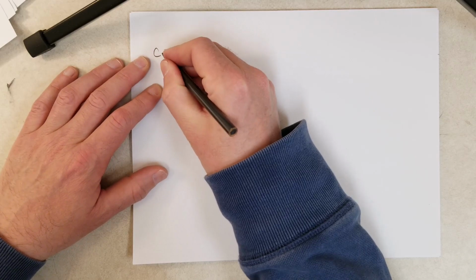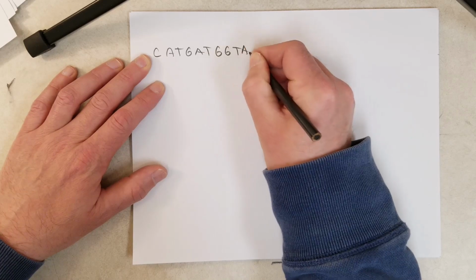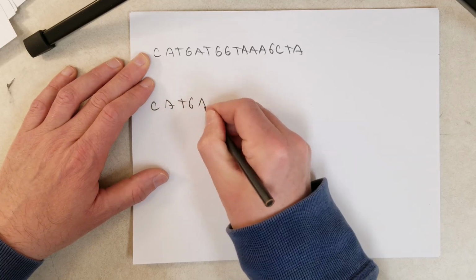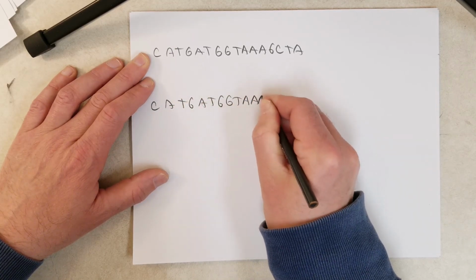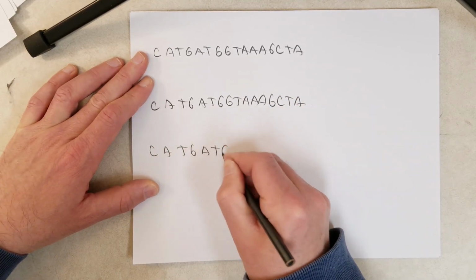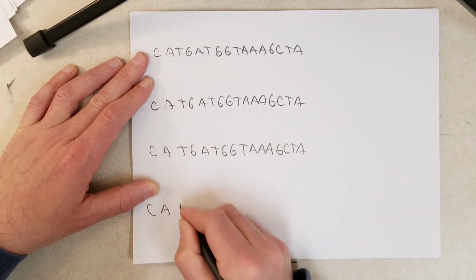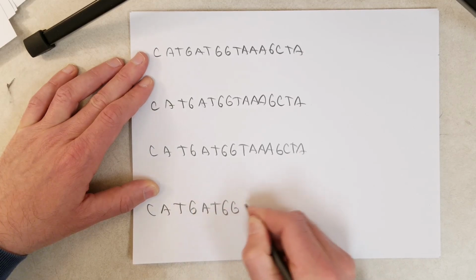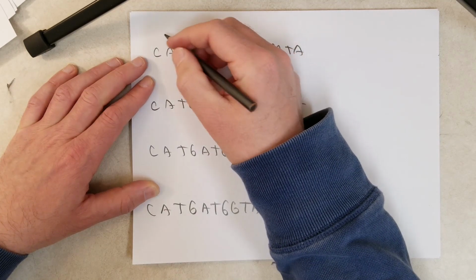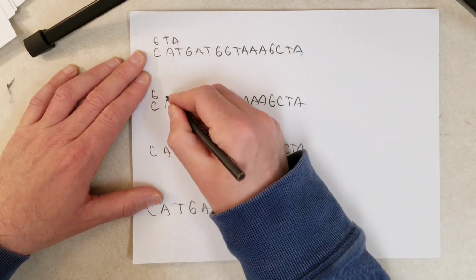Okay, so let me briefly put in 4 copies of the template. Now keep in mind there are thousands of copies of the template in this reaction tube. And I hope this helps you understand Sanger sequencing. This is essentially how I describe it in the notes. So if you read the notes, you probably know what I'm doing here. If you didn't read the notes, then reading through the notes later is going to be really easy for you.